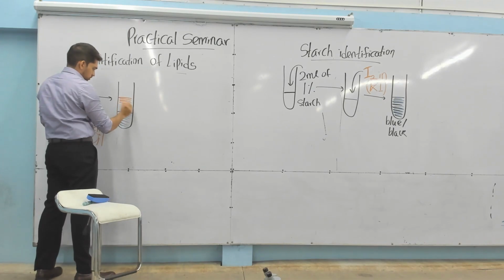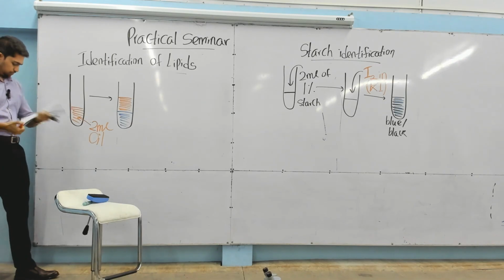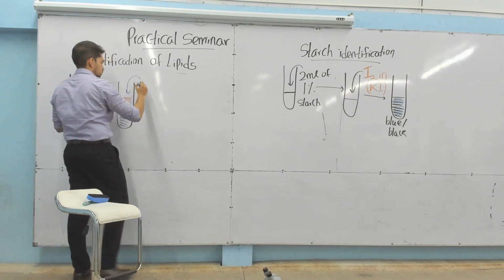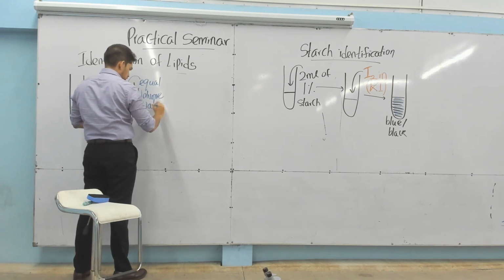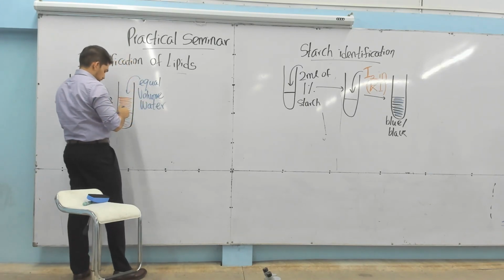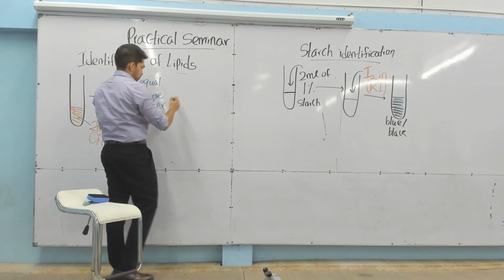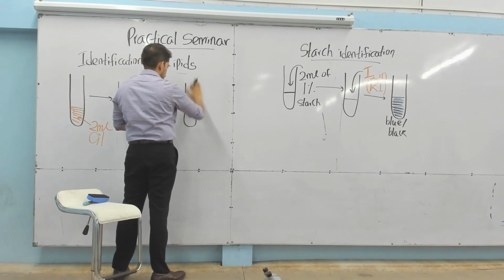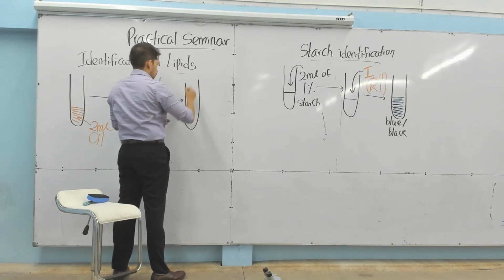Oil is going to be at the top. Okay. Equal volume of water. Right. Then what are you going to do? You are going to add a few drops of Sudan 3.